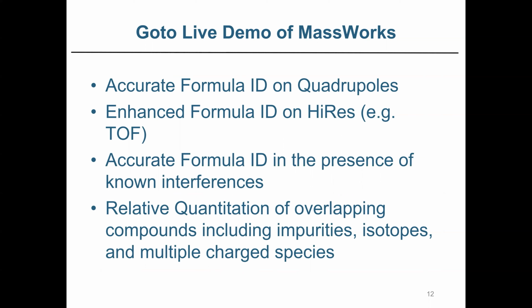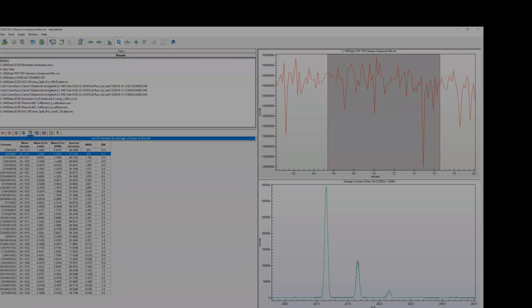I told you I was going to try to keep this short. But what I'm going to do is jump into the software. I'm going to show you a couple of examples of what we can do with this calibrated data, and hopefully it will become clear. And again, we'll do questions and answers at the end. Okay, so let's go to our software.